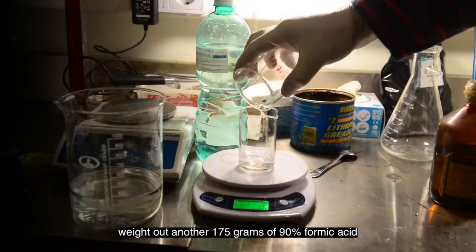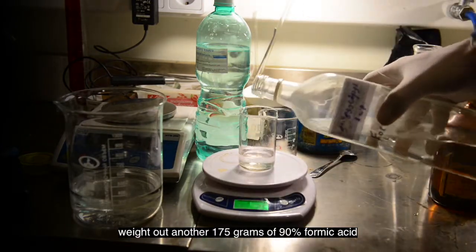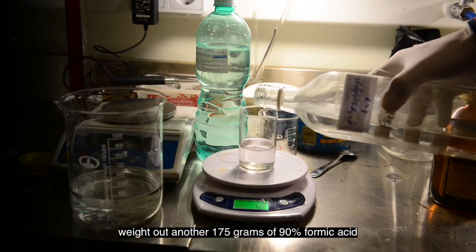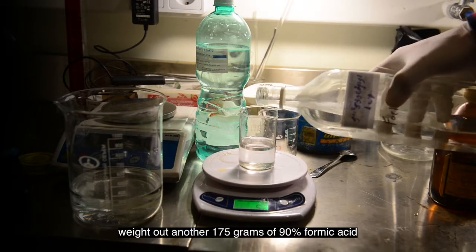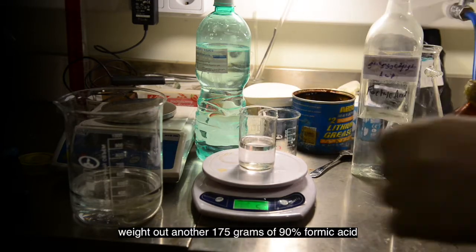In another beaker weight out 175 grams of 90% formic acid. In the video, we made a mistake and measured only a third of the required quantity. Because of this, we had to add a missing acid.